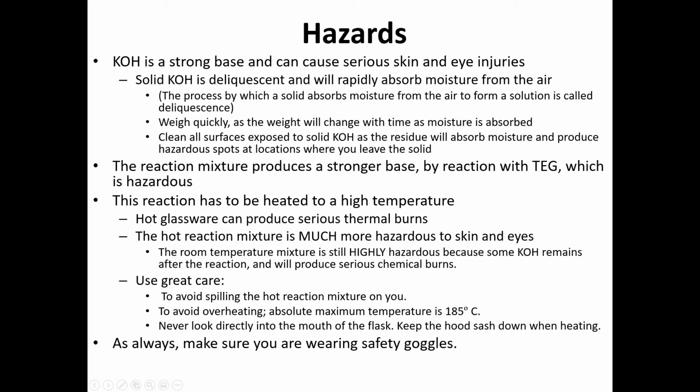Because this reaction has to be heated, we'll be working with very high temperatures, so be careful with what you touch. The glassware would be hot, the heating mantle would be hot, the mixture would be hot, and so you don't really want to touch this with your skin.